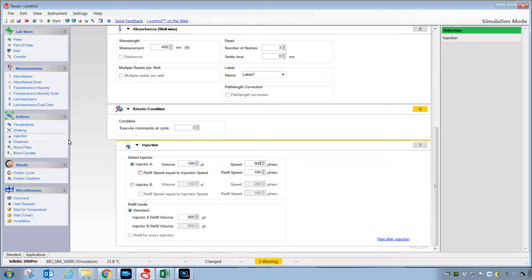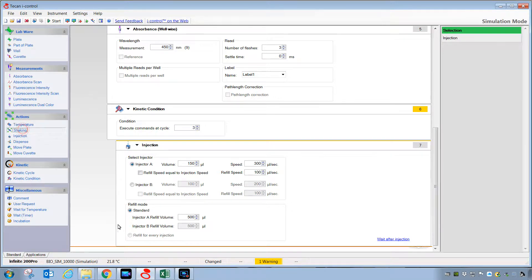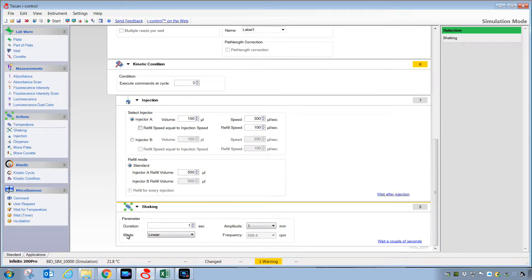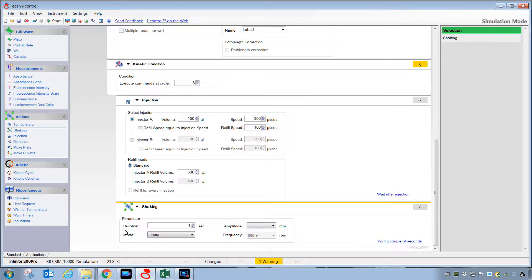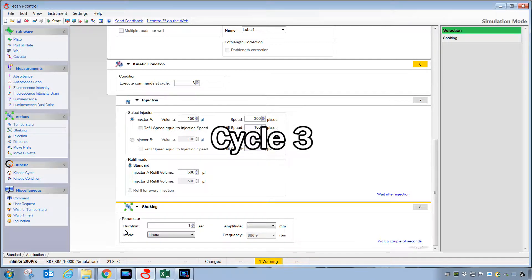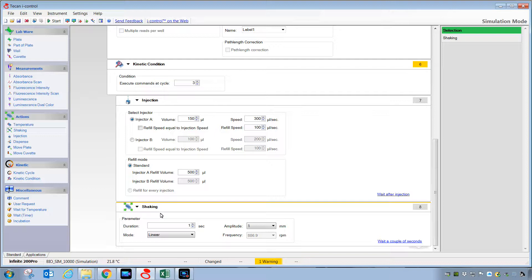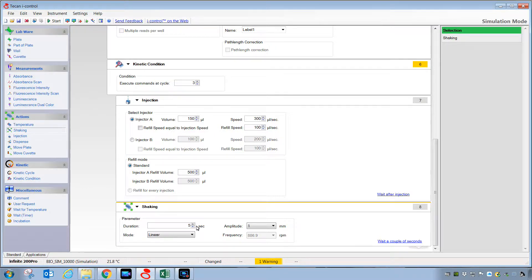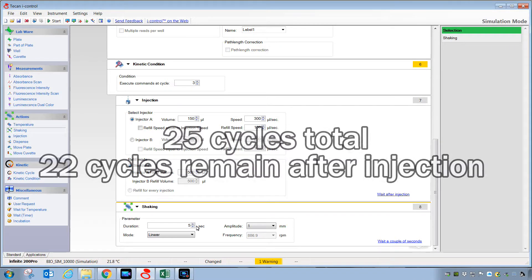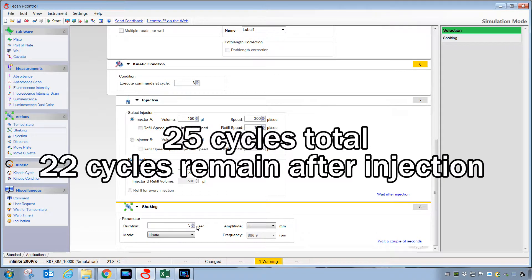Then, we could also ask for a shaking step when that's completed. Now, once the reader gets to step three, it will have collected a third absorbance reading, then it will inject, and then it will shake for an amount of time here, and then it will go on to complete the remaining 25 steps in the kinetic.